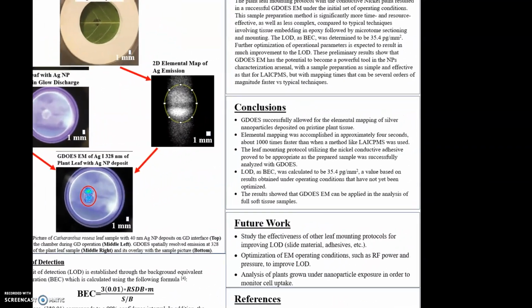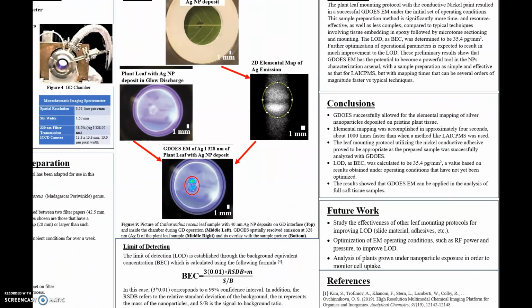Finally, our future work will aim to study the effectiveness of other leaf mounting protocols in an effort to improve our limit of detection. In addition, we will aim to optimize our elemental mapping operating conditions, also in an effort to improve LOD. Finally, we will aim to study plants grown under nanoparticle exposure in an effort to monitor cell uptake. Work on microarray substrates is currently being done as part of a nanoparticle cell uptake study. Aldo Hernandez's poster can be referenced for further information.